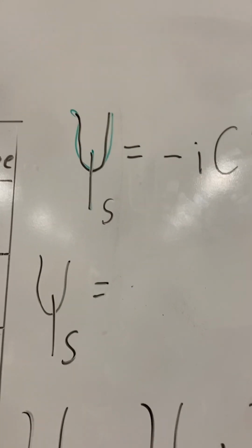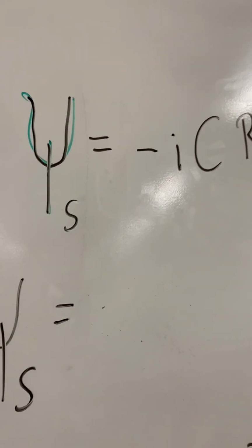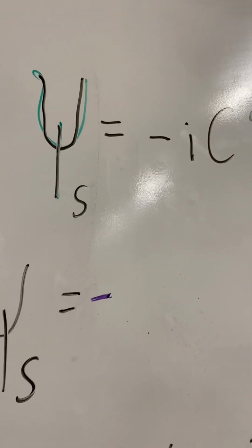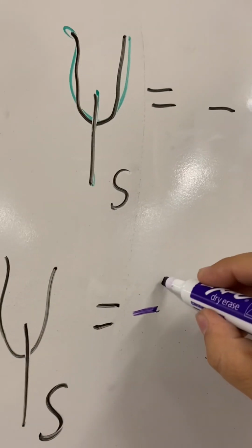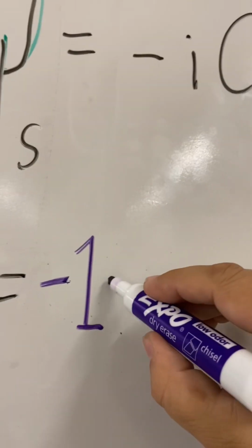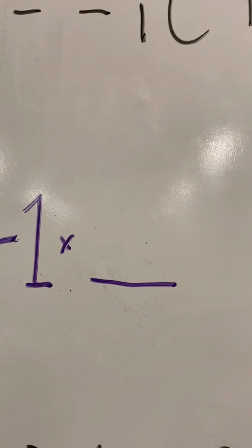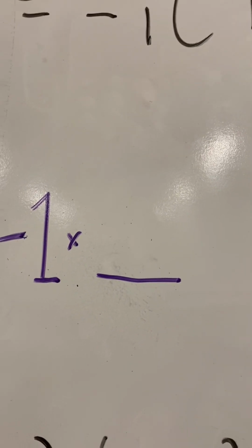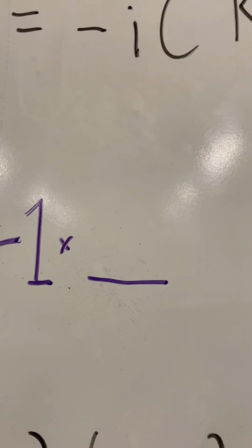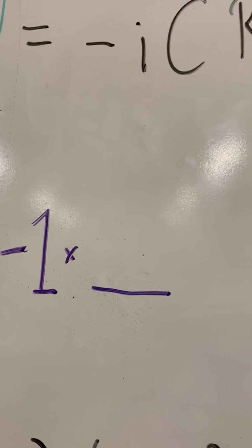Now go to the box where it's asking you to calculate the solute potential and use this formula. So first you have your negative sign, and then for ionization, since it doesn't ionize, we're going to use 1. We can't use 0 because then our whole number would be 0. So -1 times the concentration. I don't know what concentration you have. That's a little bit different for everybody because of the line of best fit. So put that concentration value in there, where your line comes across the x-axis, where the value for y is 0. That is the value you're looking for.